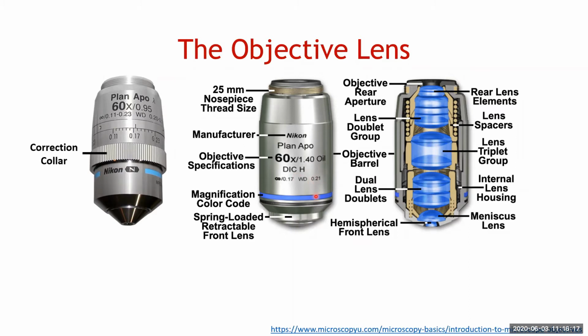The objective lens is something people don't quite think about. Most people know about the magnification and just follow that. That's not necessarily wrong, but it ignores a lot of things that could help you choose a better objective, or at least understand what you're doing. So we have the manufacturer, of course. This line, which we'll get to later, is all about the corrections for the different aberrations that could happen. Then magnification, and this little number usually put next to the magnification is the numerical aperture, probably the most important thing on the lens, and we'll go into that later.